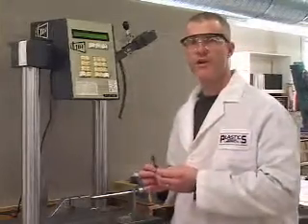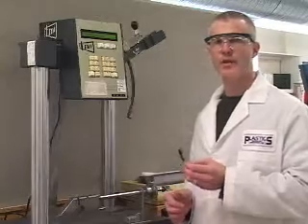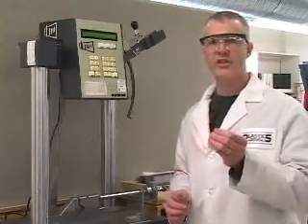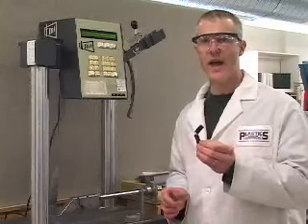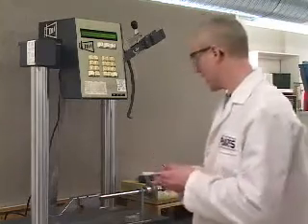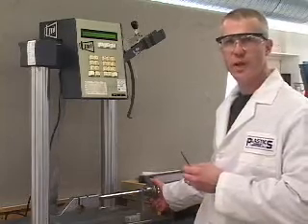Some important considerations for notched Izod impact are the notch itself, which has very specified dimensions, the depth under the notch, which is very critical, and also the amount of pressure that is used on the vise to clamp the specimen in.